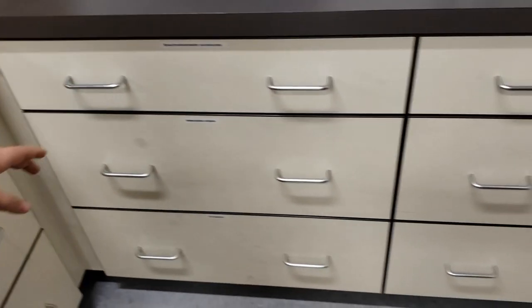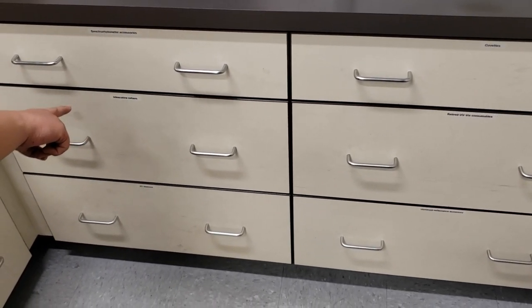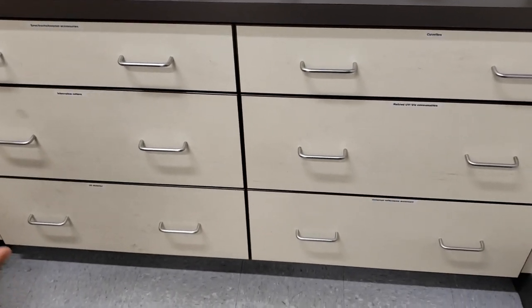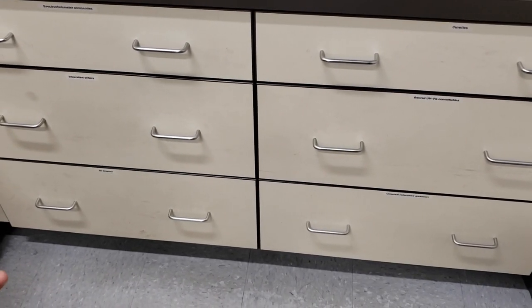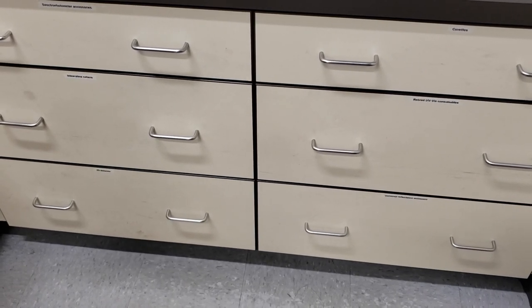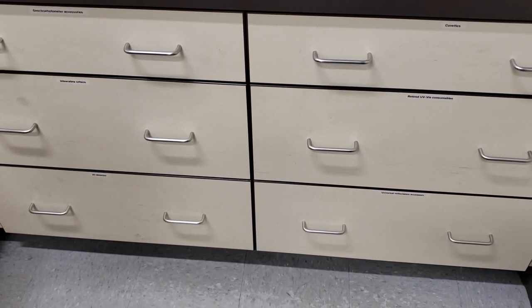The rest of the drawers — other than the middle right — contain the various detectors we own: the integrating sphere on the left middle, the 2D detector on the bottom left, and the universal reflectance accessory on the bottom right, which I'm going to call the URA from now on. I'm going to work with the integrating sphere to show how it works, as it is a bit more complex, but the integrating sphere has all the same operating principles as the 2D detector or the URA.